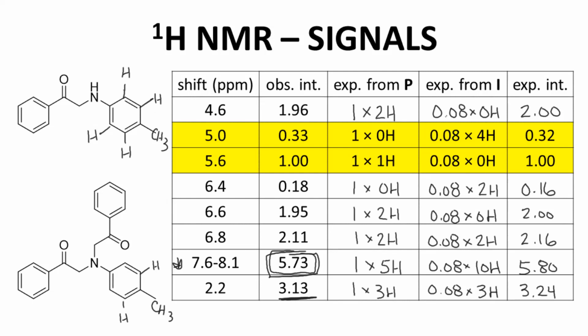Collectively, the NMR data strongly support that the impurity is in fact this molecule in the bottom left of the screen. We could gather other data, but I'm comfortable with this structural assignment, which seems very consistent with both the reaction and the characterization data. I think this mystery is solved.